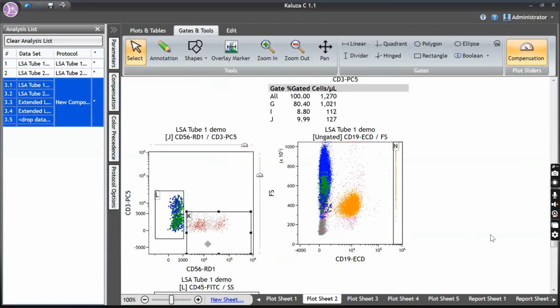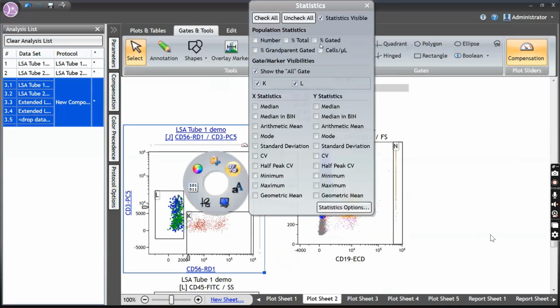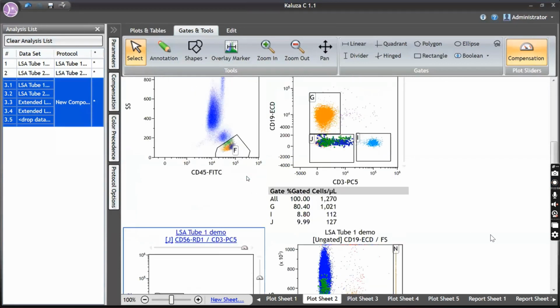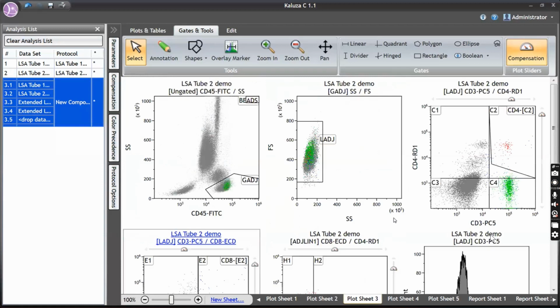And how about the NK cells? NK cells are present. Okay, the NK cells are present. So NK cells are around 70 cells, which is fairly okay. So NK cells are there. So this is a case of T negative, B positive, NK positive combined immunodeficiency. Okay, so this is one case.